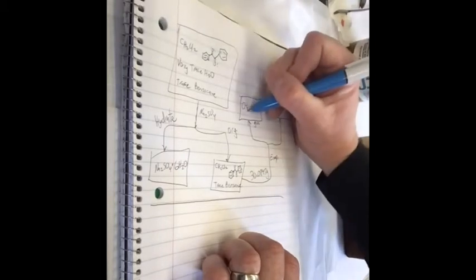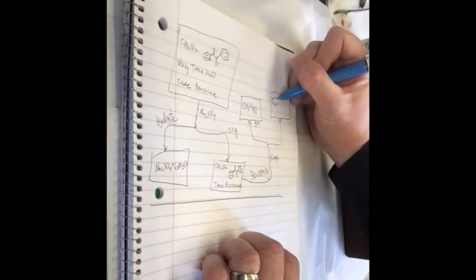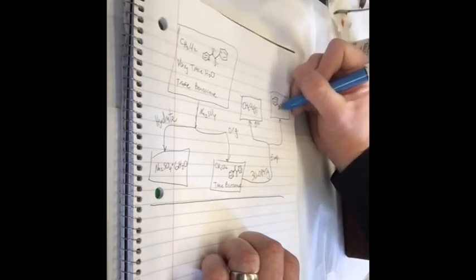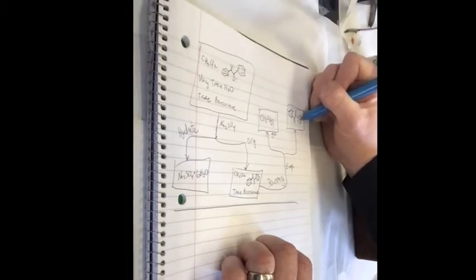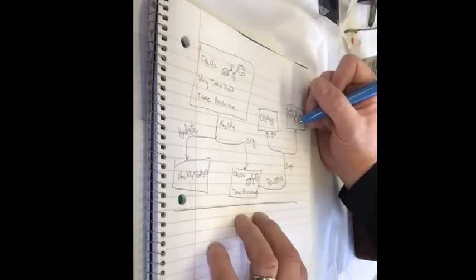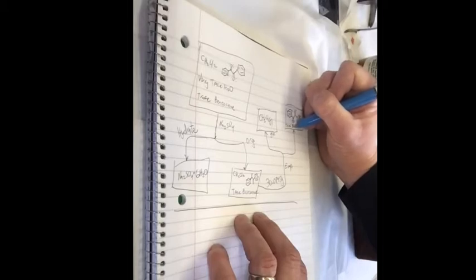Yeah, methylene chloride gas. And then over here, you'll have your solid yellow benzil. And the trace impurity of probably some benzocaine in there still.